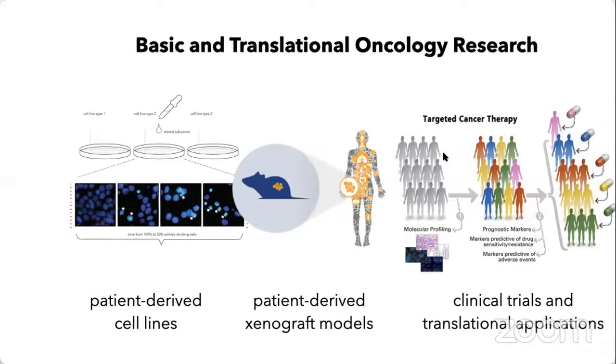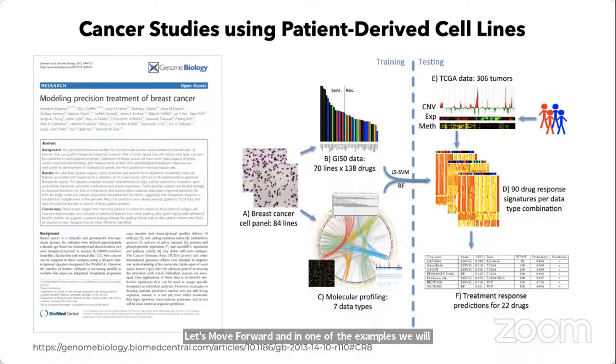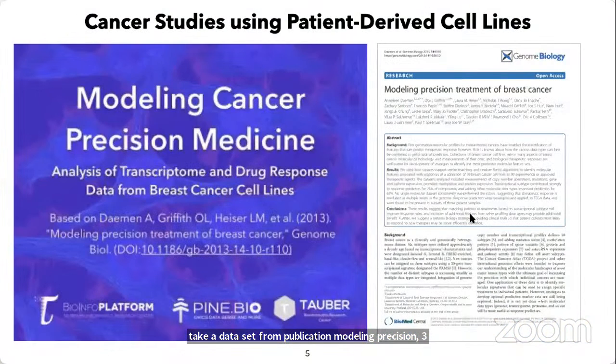Let's move forward, and in one of the examples, we will take a data set from a publication modeling precision treatment. So we will take a data set from a well-known publication that is modeling precision treatment of breast cancer, which was featured in Genome Biology in 2013.